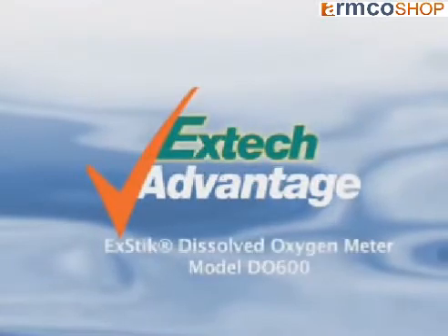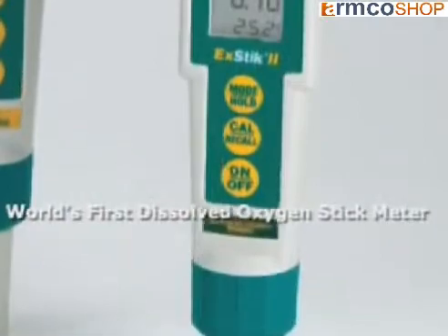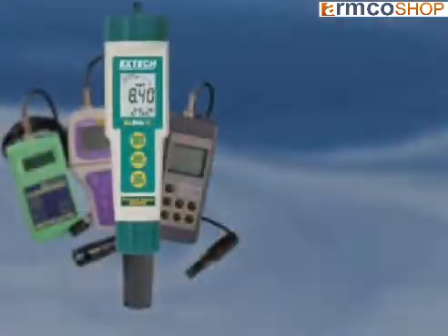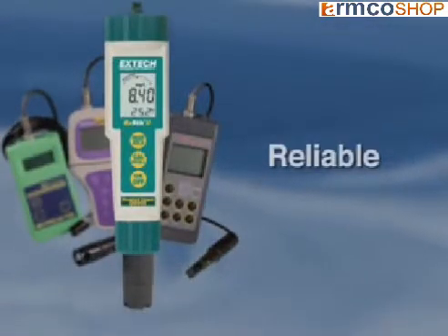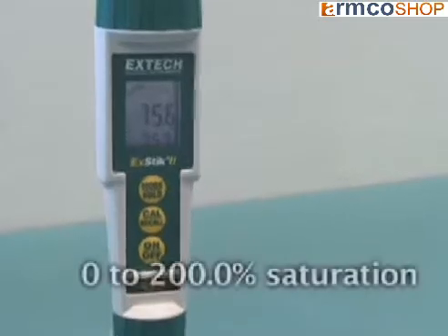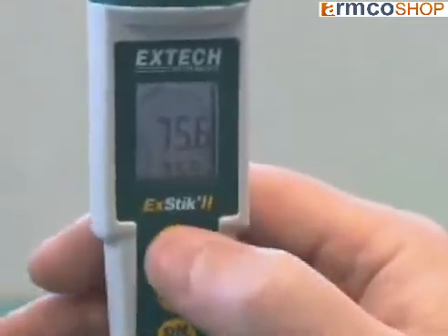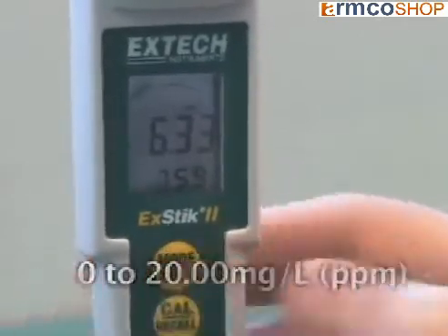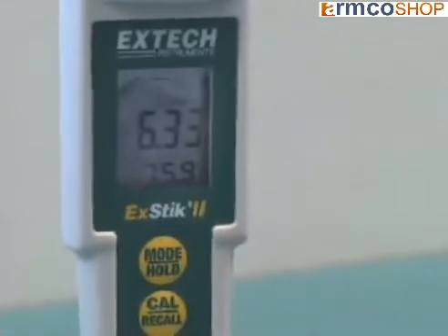Announcing the world's first dissolved oxygen stick meter designed by X-TEC's leading engineers. The X-Stick dissolved oxygen meter offers the same functionality as a regular handheld DO meter at a fraction of the cost, without compromising the quality or accuracy of the measurement. The DO600 displays the oxygen level as percent saturation and concentration levels in milligrams per liter or parts per million. It also displays the temperature and an analog bar graph that shows you the trend of oxygen level when measured at different depths.